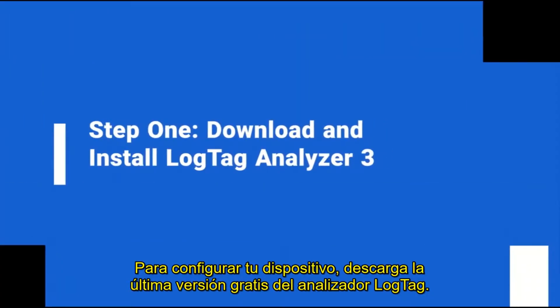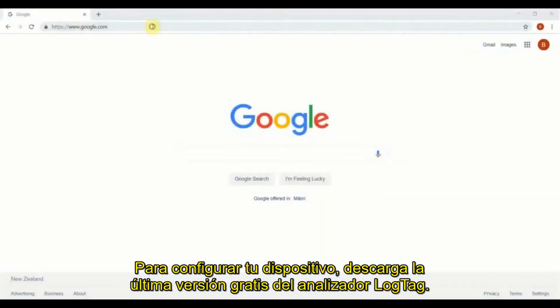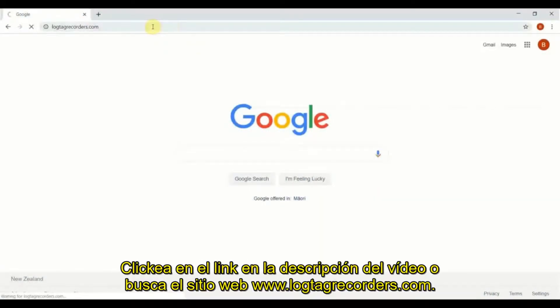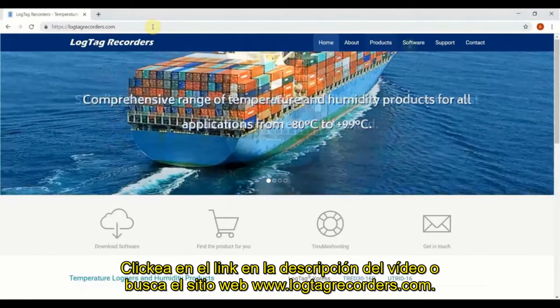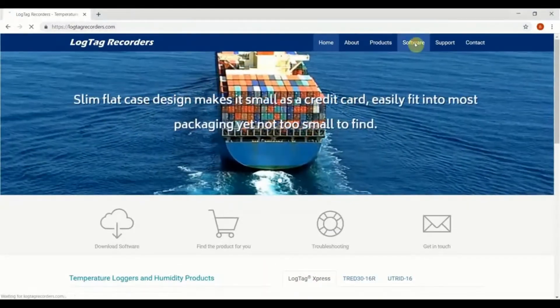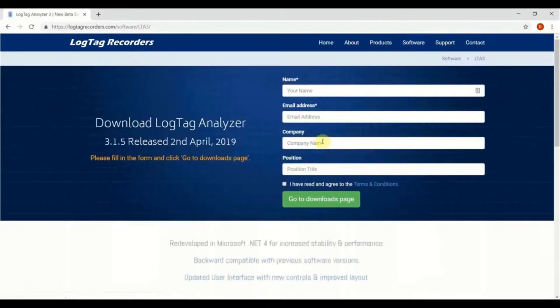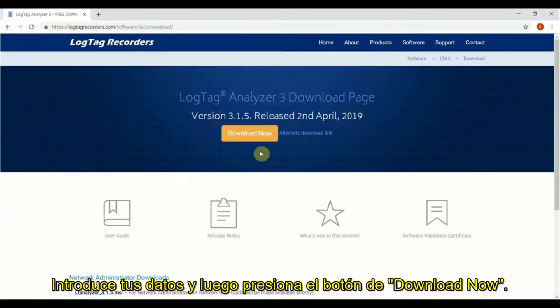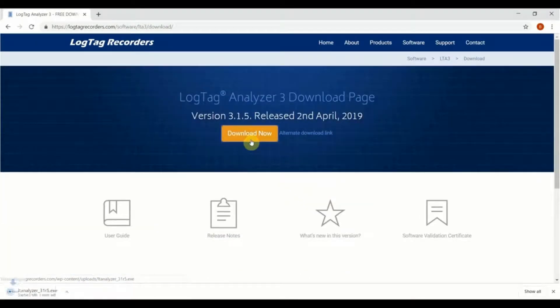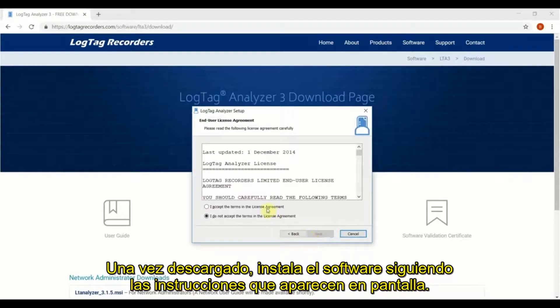To configure your device, download the latest version of our free LogTag Analyzer software. Click on the link in the video description below, or browse to our website at LogTagRecorders.com. Navigate to Software, click on LogTag Analyzer 3, enter in your details and finally click Download Now. Once downloaded, install the software by following the on-screen instructions.